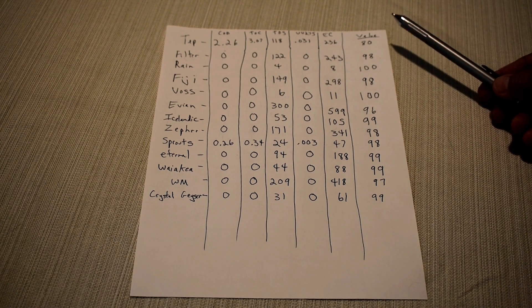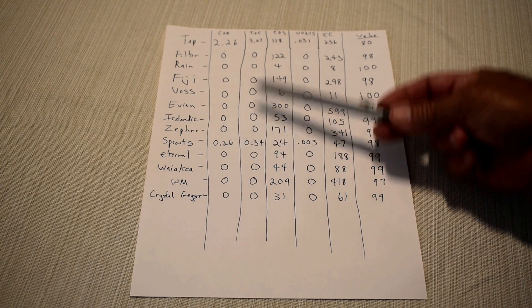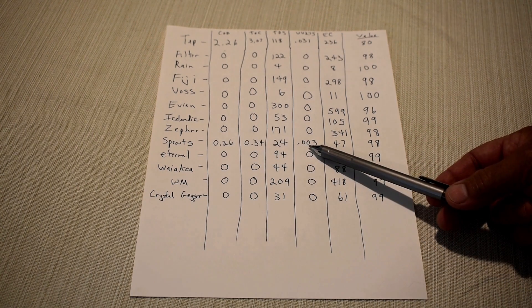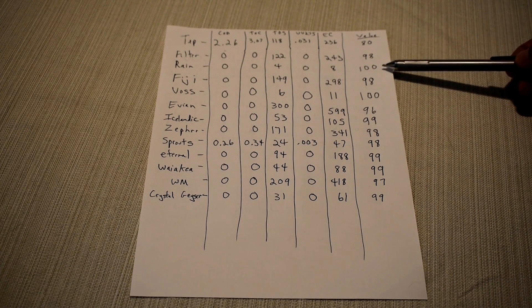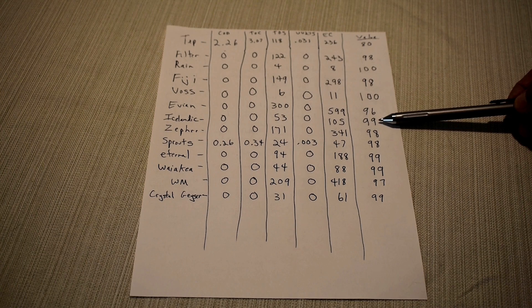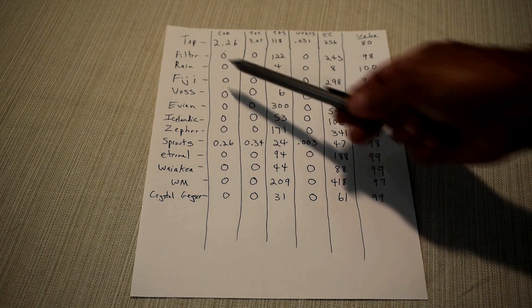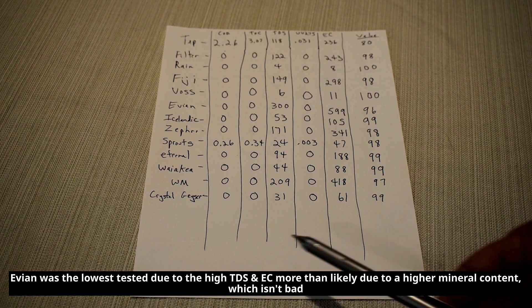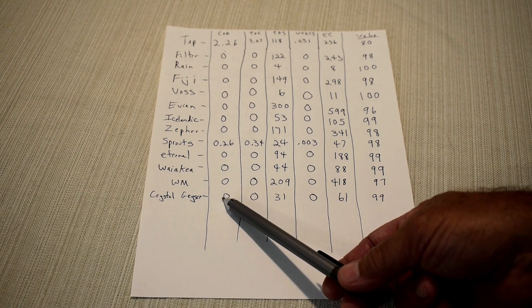Okay, and here's a look at the results for all the testing that I did. You can see that every single brand of water with the exception of Sprouts had a zero for COD, TOC, and UV-275. The reading was very low so it's nothing bad but there's still a reading there and it's well below my tap water. You can see all the values. The highest was the rainwater 100 followed by VAS 100, 99 would be the Icelandic along with Eternal and Waiakia and Crystal Geyser. To me all of these brands of spring water have a very similar taste. The only one that's different is the Zephyr Hills brand, and based on price the best deal for the money in my opinion is the dollar store's one gallon Crystal Geyser brand.